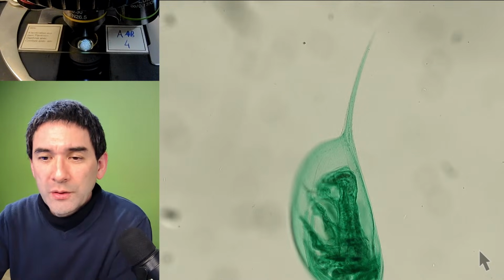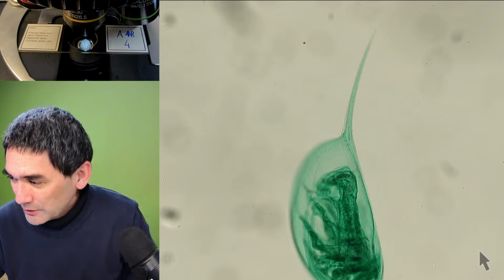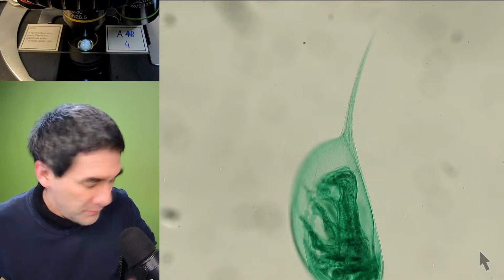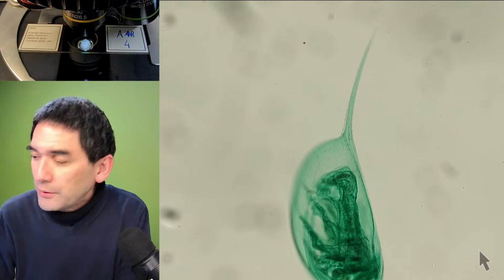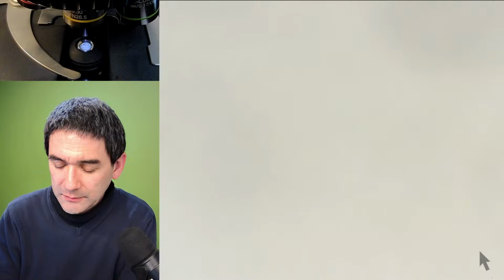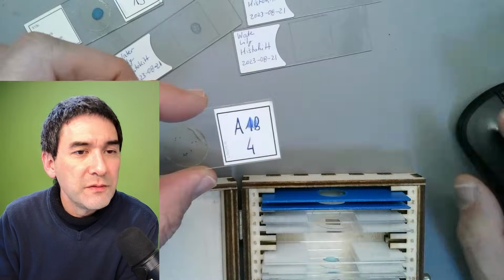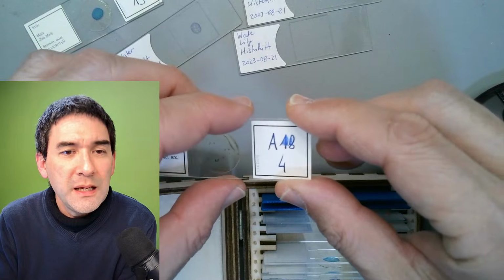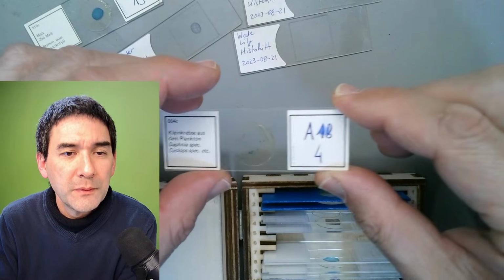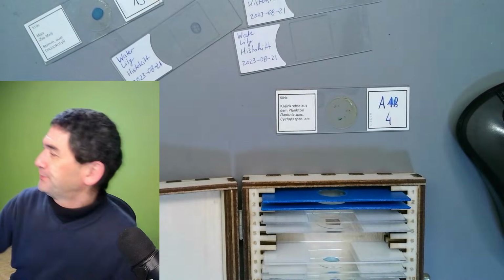I wonder what you wrote on the right part of the... Ooh, I did not write anything, but I will show you because you wanted to know, very briefly. This is a commercial slide. So I want to show you the desk view. You were wondering about this here, A184. What does this mean? I just want to show you the original box.